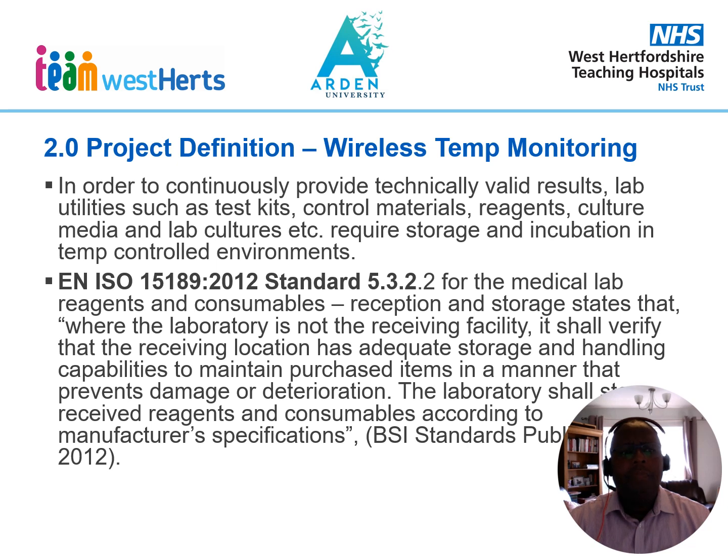So this project is basically going to enable the laboratory to continuously provide technically valid results by ensuring that reagents, consumables such as culture media and even laboratory cultures are stored within temperature controlled environments.